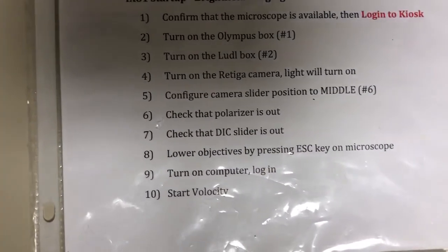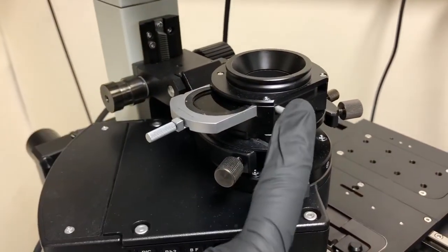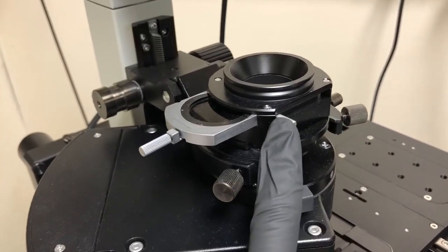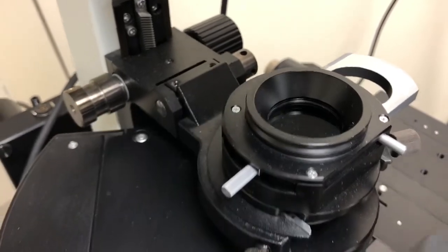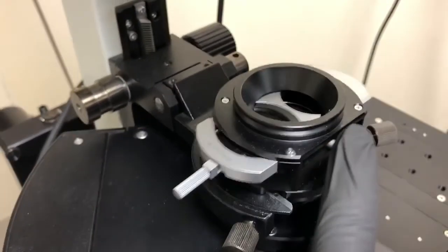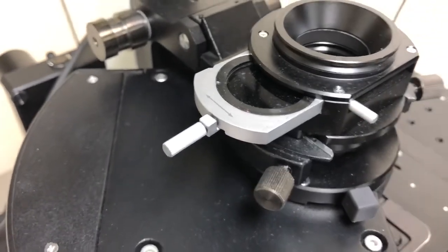We need to check that the polarizer is out — that's step number six. The polarizer is this component here; you move it with this. That is the in position — you can see there's a piece of glass there, which is the polarizer. That is the out position, so we need it in the out position.